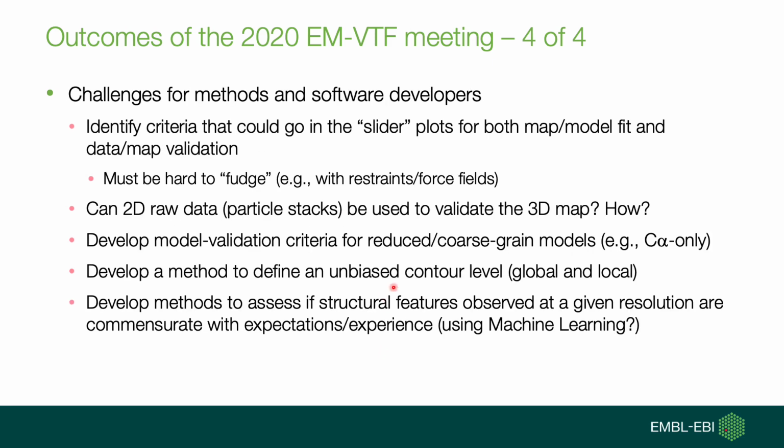There are also a number of challenges for methods and software developers, for example, to come up with criteria that could go into these so-called slider plots, the summary plots in the validation reports, that would have to be hard to fudge. So not things like the atom inclusion score. There were open questions like, can 2D raw data, particle stacks, be used to validate 3D maps, and how? There's a need for more model validation criteria, particularly for reduced models, for example, C-alpha only models.